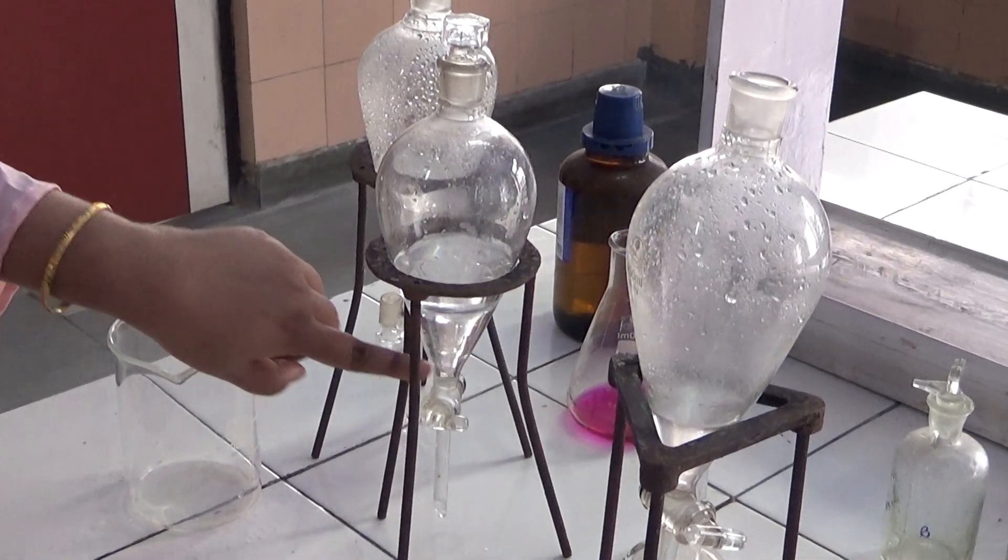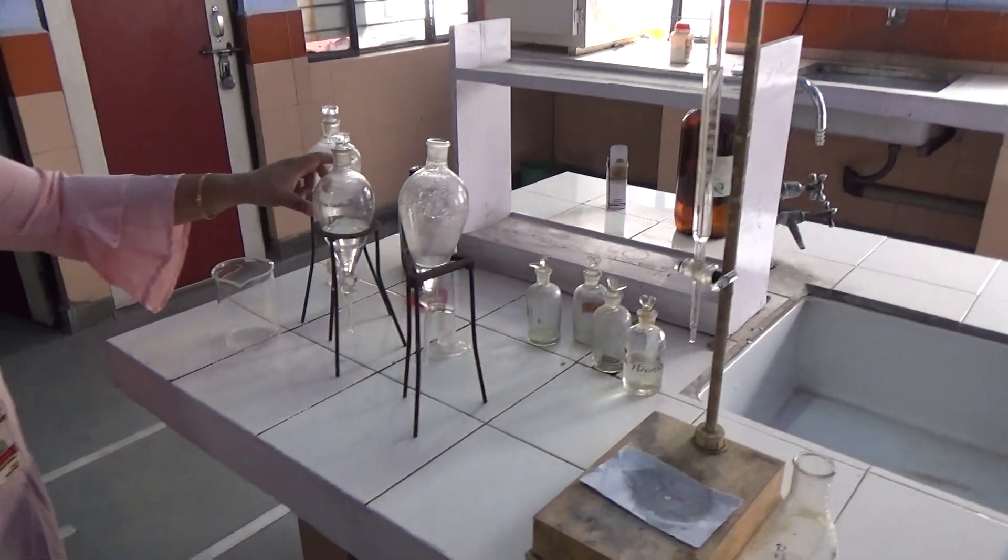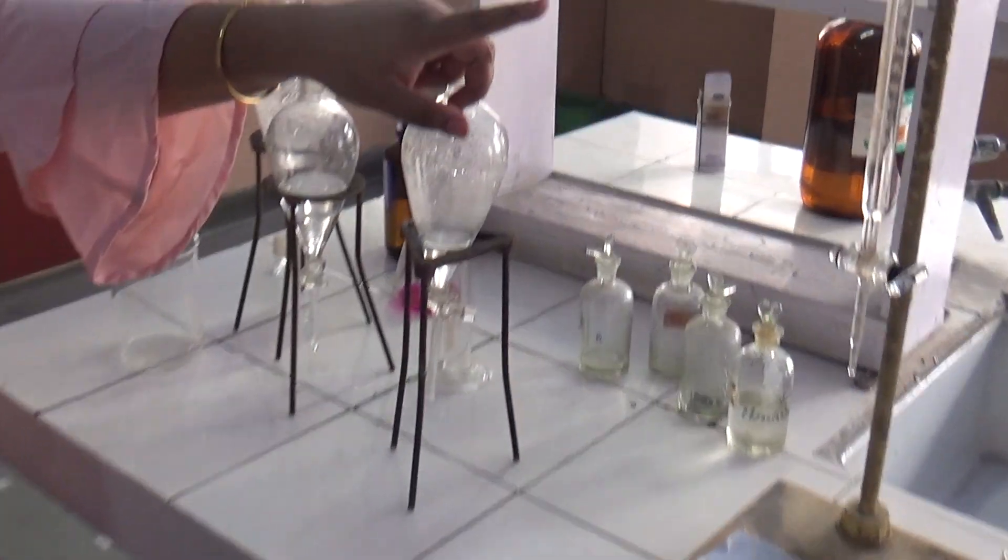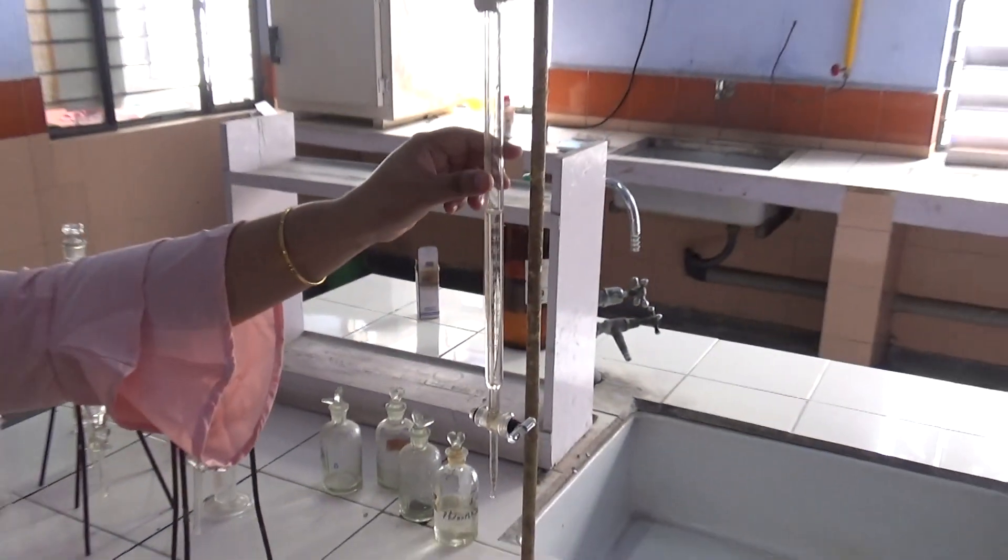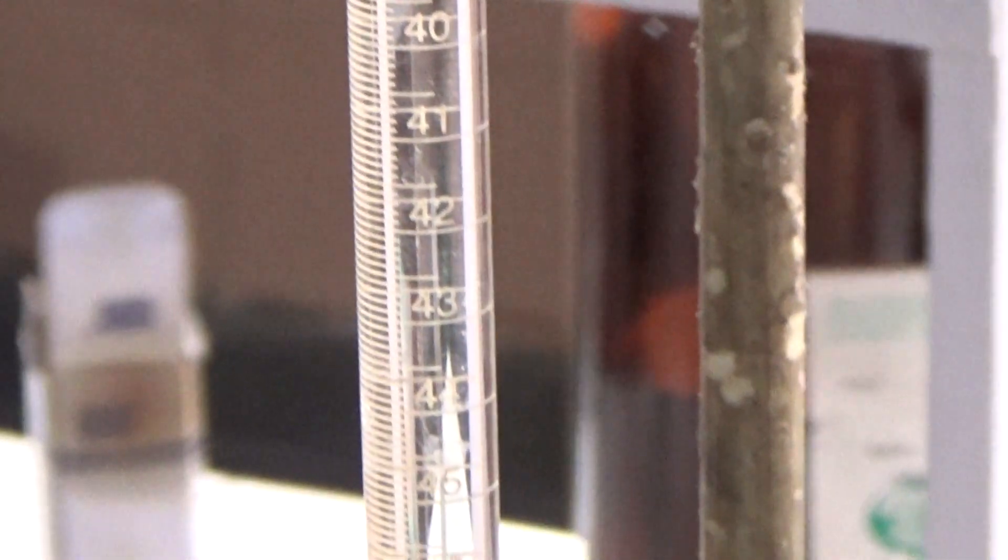By separating your aqueous layer first, we will be doing the titration against 0.1 normal sodium hydroxide, and the organic layer titrating against 0.01 normal sodium hydroxide, for 1.5 grams and 2 grams of benzoic acid.